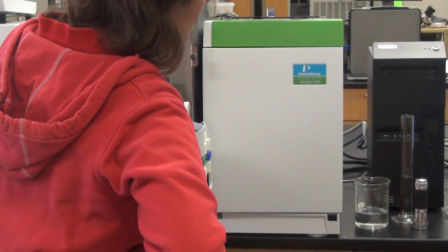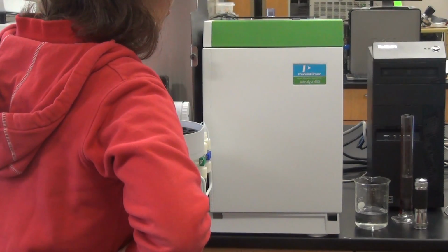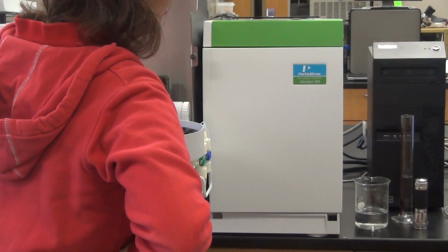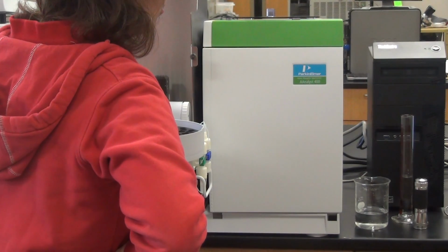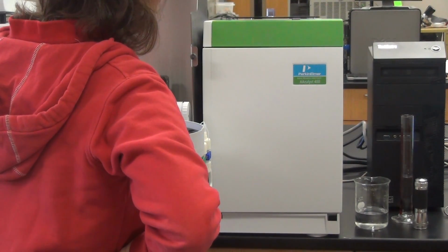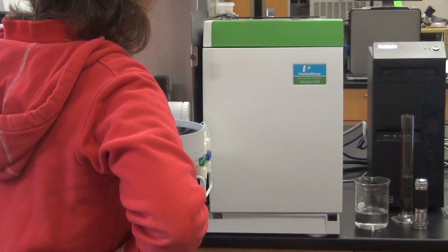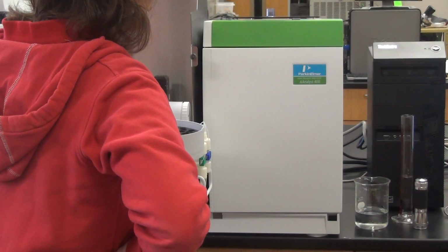If you go below zero, that means I didn't have it aligned, because I zeroed it with it in alignment. But I have goofed up before. Minimum, whatever minimum is. Now, if the windows were in, you will have some absorbance there, especially if you're going to line it on something other than copper. So you always set it to minimum.